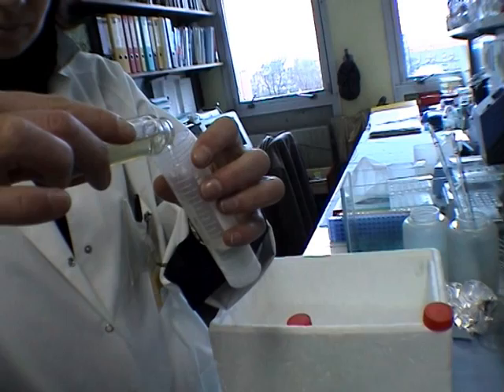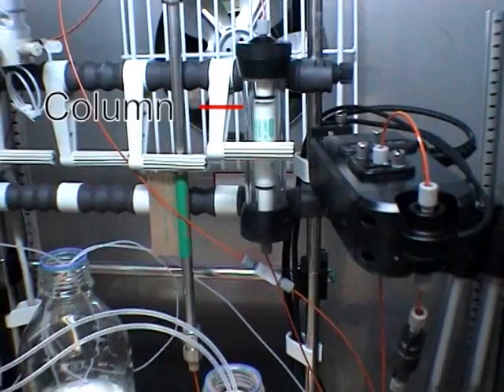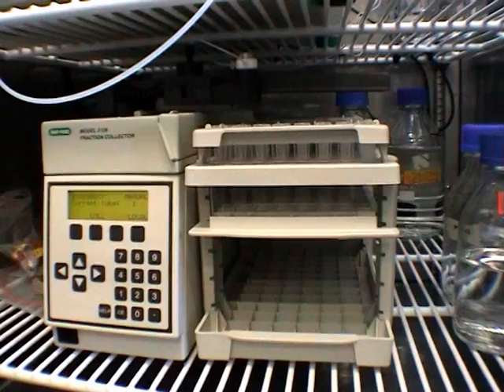By injecting the supernatant into a chromatography column, the molecules can be sorted as a function of their properties, such as size or electric charge. The separation of the mixture is followed on a screen, and the isolated molecules are recovered and fractionated in a series of test tubes. The first step is complete, the protein is pure, let's continue to its crystallization.